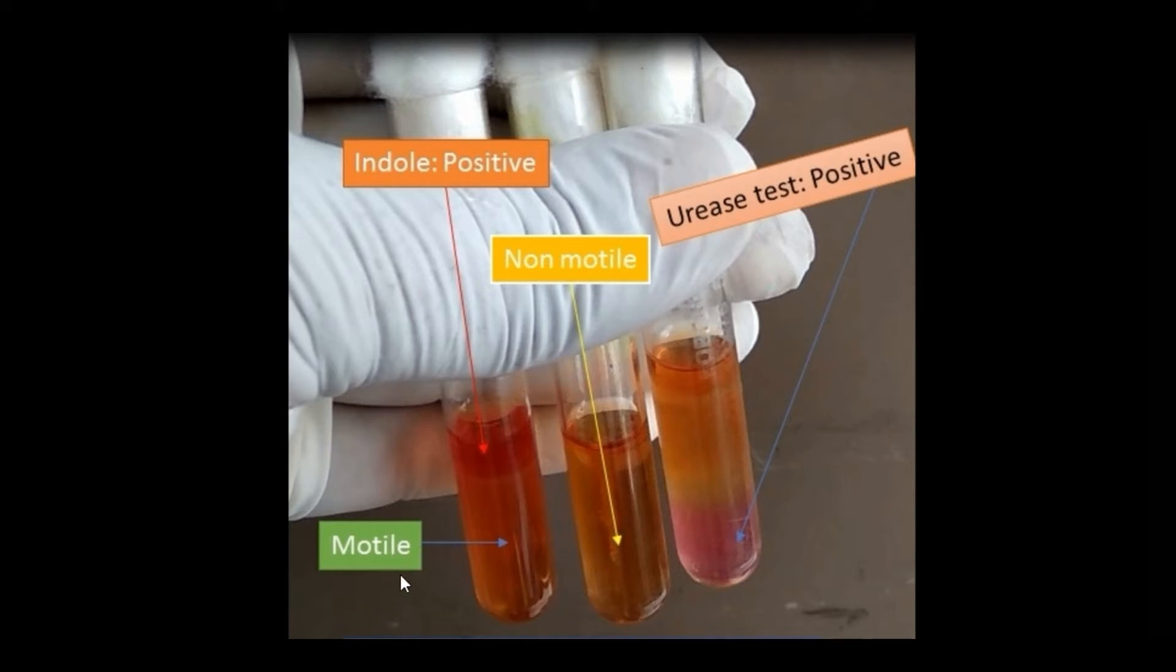Let's start from motility. Growth of organism throughout the medium indicates the organism is motile, whereas growth restricted around the stab line indicates the organism is non-motile. Here you can see growth restricted around the stab line, whereas in this medium growth is diffused. Therefore, the organism is motile in this tube, whereas non-motile in this tube.